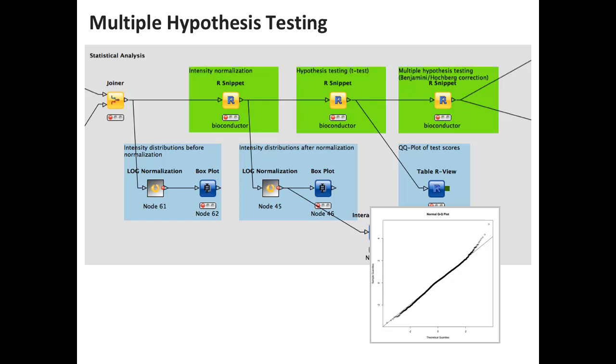I don't recall the number, but tens of thousands, I think. Round about 10,000. So the intensity normalization, you use the same factor where you're looking for stable analytes and you're just taking area? Yeah, here the R does some more magic, but yeah, it's basically background normalization.